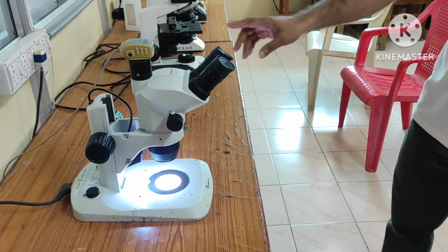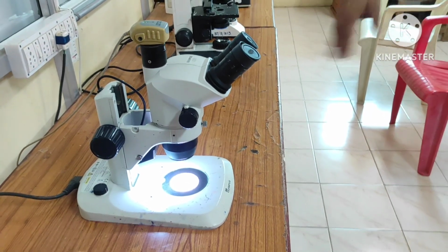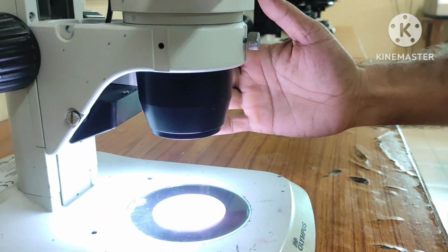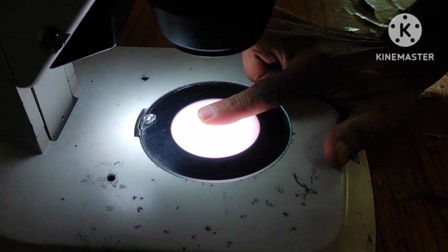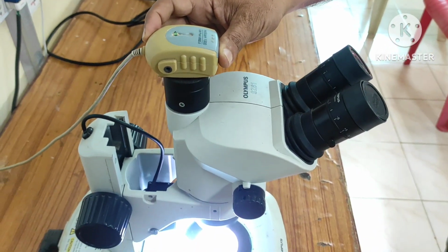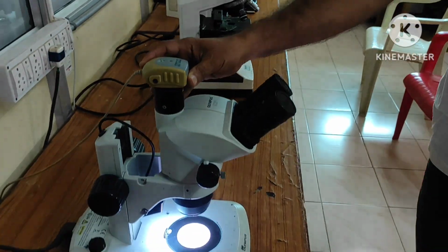Okay. So friends, as I told you, another type of microscope, this is called a stereo microscope. Here the things are just opposite actually. These are the eyepieces, right. Another lens is present here, right, and the specimen we can put here, that will be visible with the eyepieces, right. This is the camera of the stereo microscope. Stereo means it can give us a 3D image of any kind of specimen, and there is no need of even a section also. So thin sections are not needed, right.